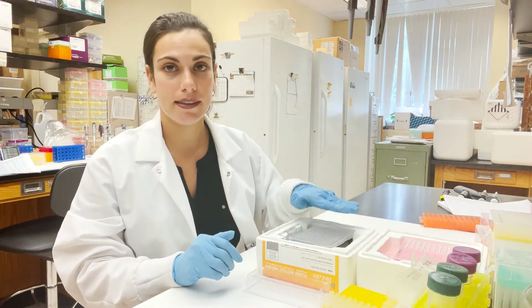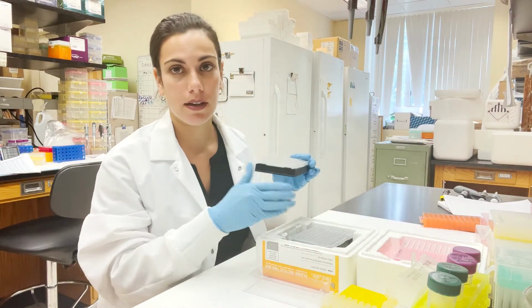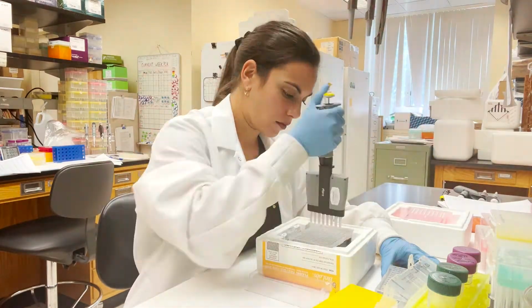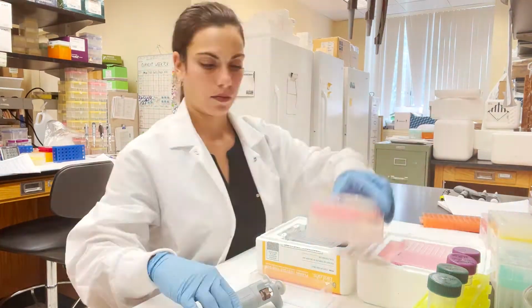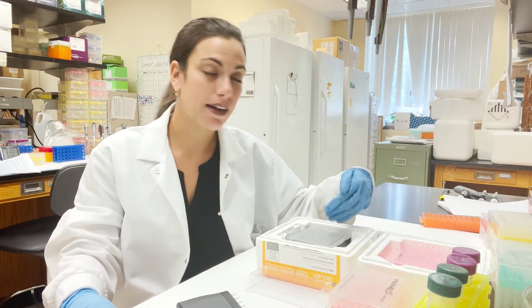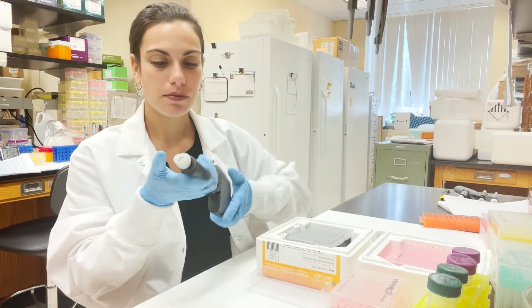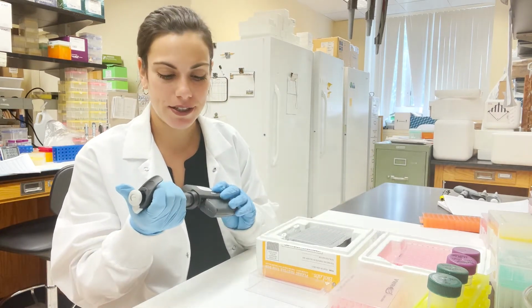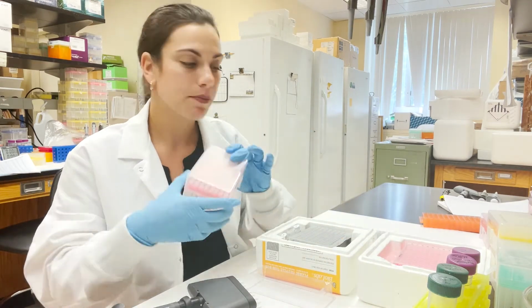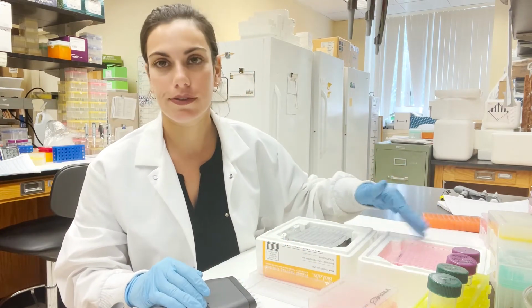We're not pipetting it into every well yet, but we're going to put our digest into every well, 20 microliters. So then we add 1 microliter of our barcode into every well. It's very important not to mix this stage up, as I guess it is important with every stage. But we also want to use filter tips if we can, so that way we don't risk contaminating our original barcodes, because we use this for every single plate.